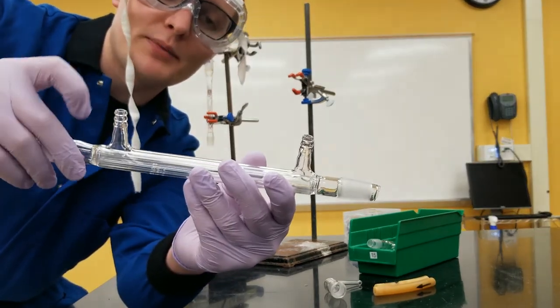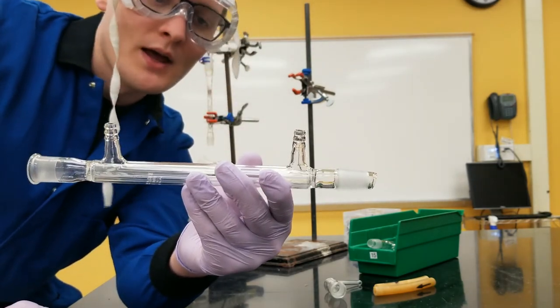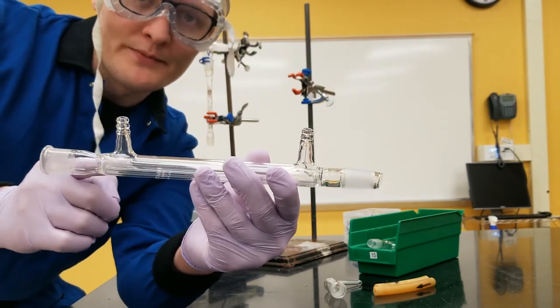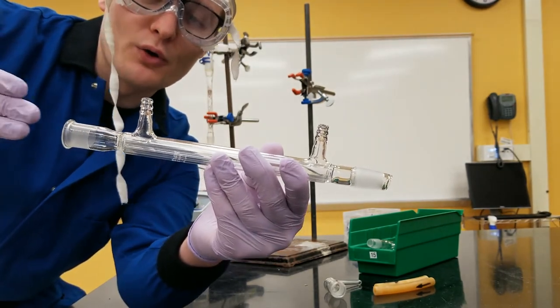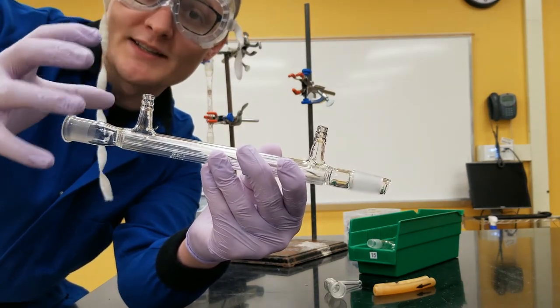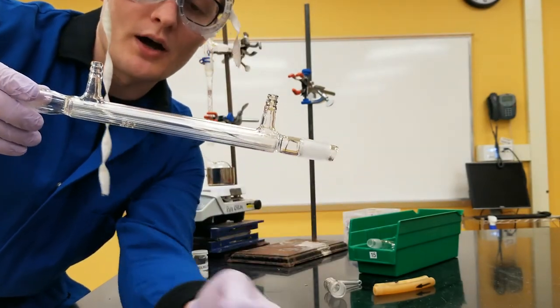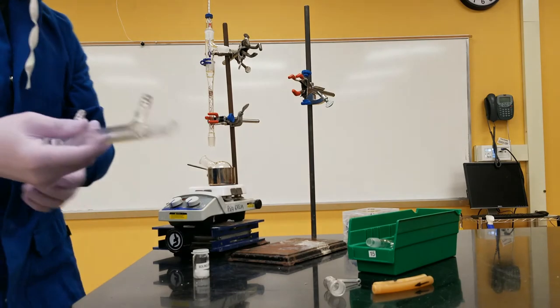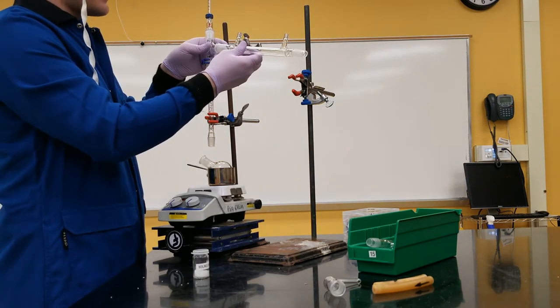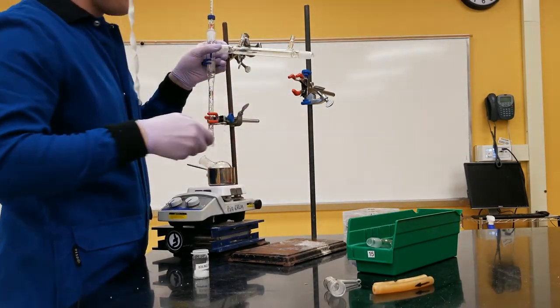So I'm going to pump water in through this nozzle and out of another one, and the water is going to cool the inner tube. And so as gases flow through the tube, they're going to be cooled and they're going to have to condense so that I can collect them as liquids out here. So yeah, this is a matter of collecting the solvents after they've been separated.